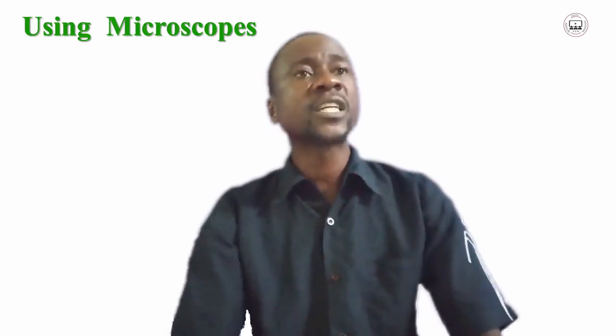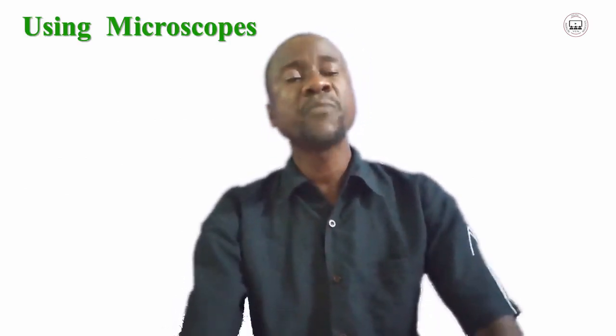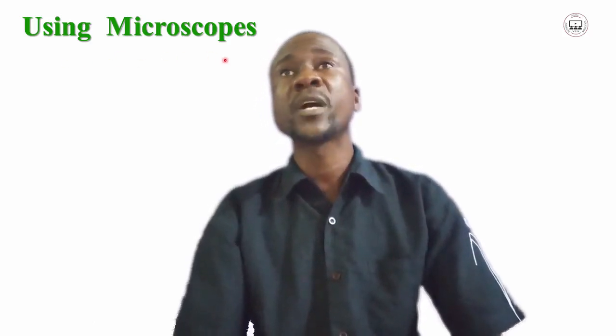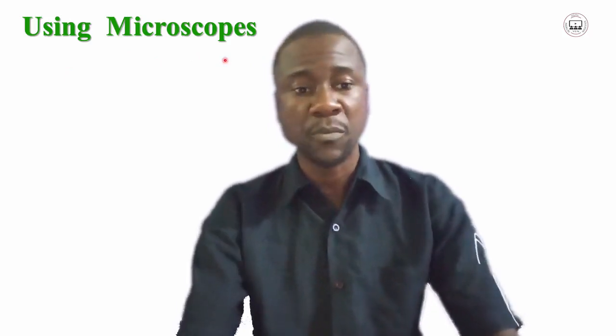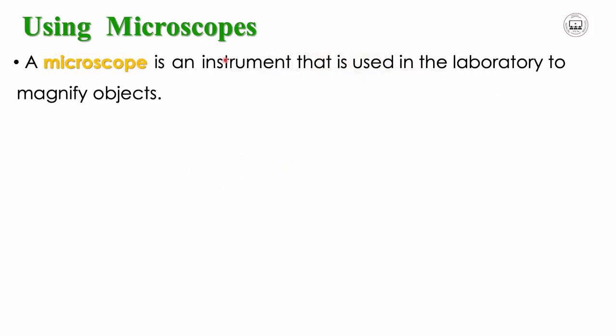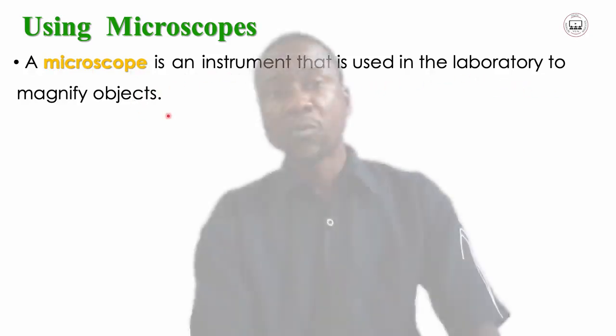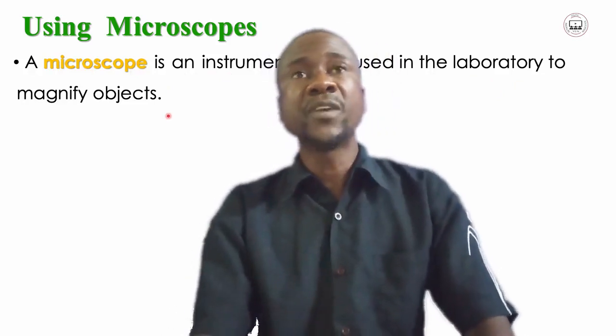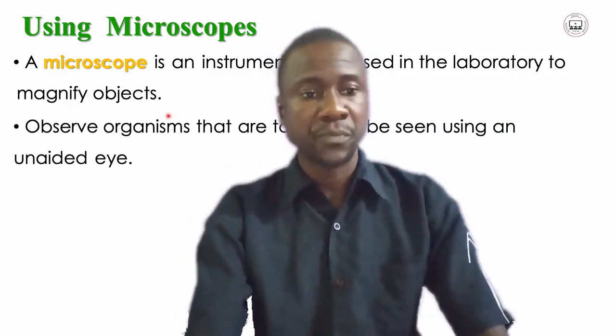Now, let us start with the microscope. How you may use a microscope. A microscope is one of the apparatus which requires a lot of attention as you are supposed to use it in the biology lab. A microscope is an instrument that is used in the laboratory to magnify objects. We have already shared in part 1 which I started with you, but now here I am giving out the meaning of this microscope.